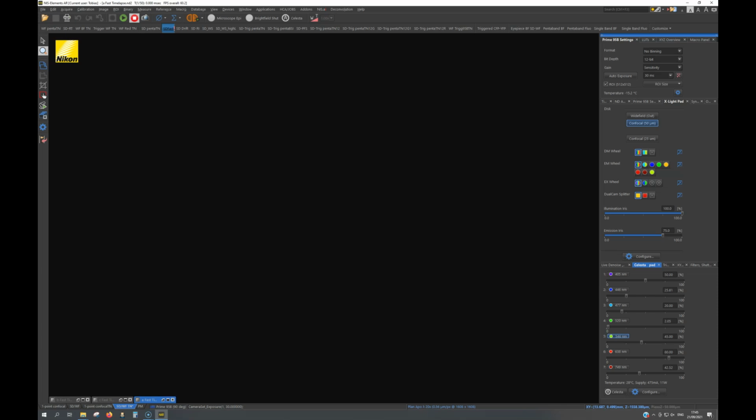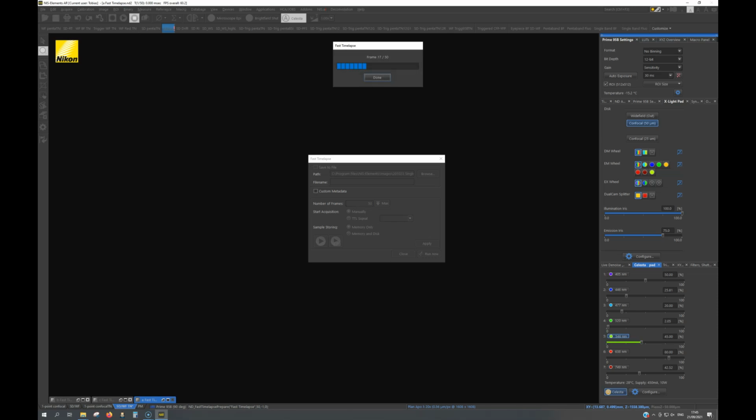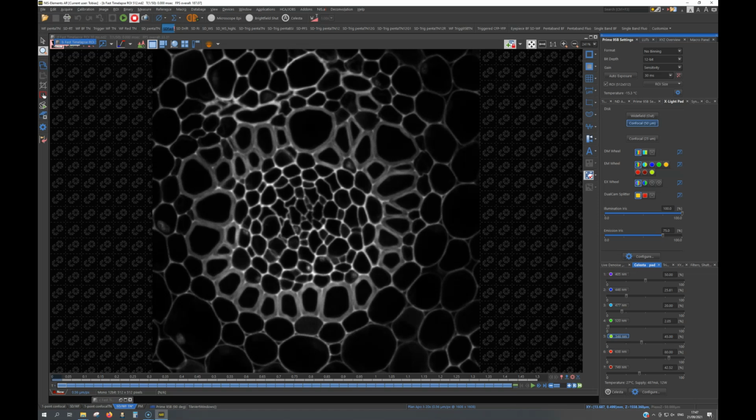In our earlier acquisition of the single-point confocal resonant images, we had a total frame time of around 33 milliseconds, so acquiring multi-point confocal images with 30 milliseconds exposure time gives us a possibility to make a comparison of the image quality we can receive if we use the same exposure time. We will do this comparison in a bit. First, we will make a quantitative comparison of our results for the multi-point scanning confocal. We can already see that the high laser power and long exposure time gave us an image of good quality.